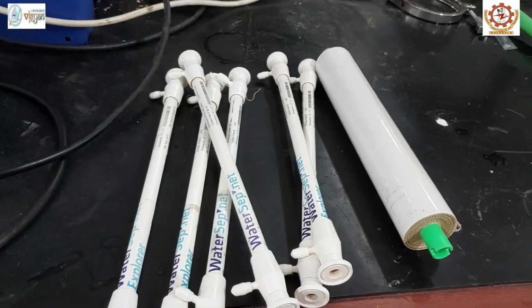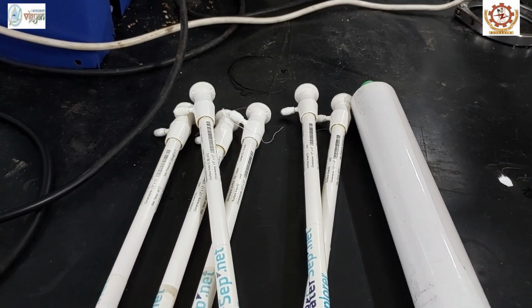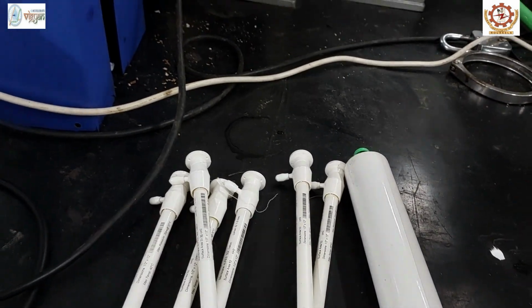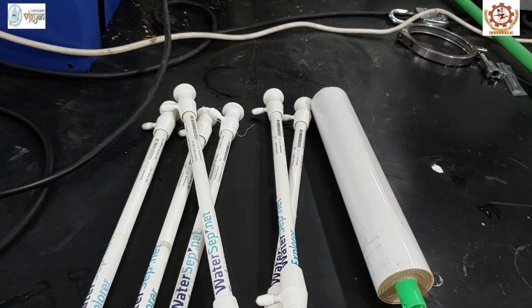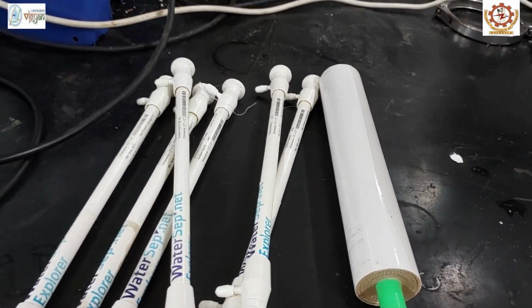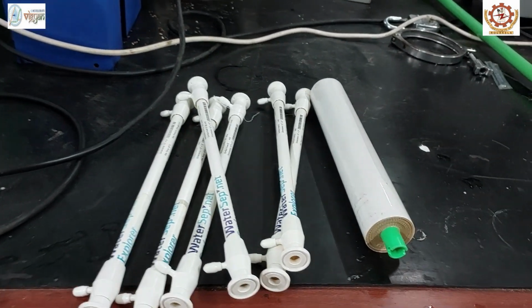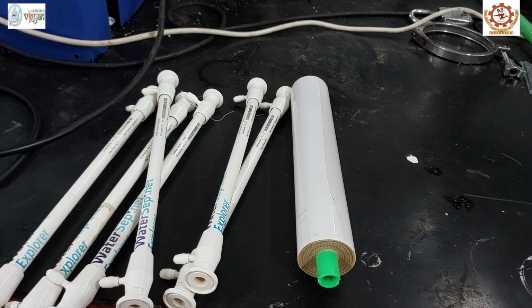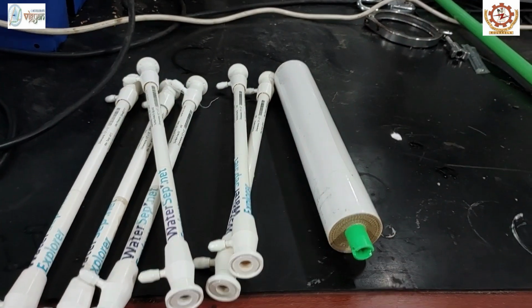In plate and frame module, the configuration is similar to that of spiral wound module. In this module, the spacers and the membranes are arranged together in layers, that is planar configuration, between flat sheets or plates. Hence, it is also known as flat sheet modules. They are more comfortable to maintain and clean but a bit costlier. Therefore, it has broader application in laboratory scales.